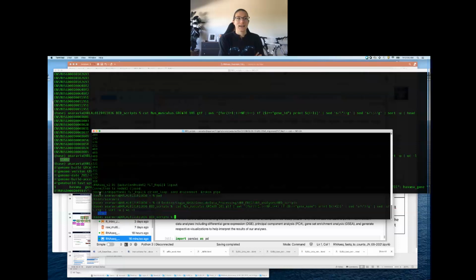Of course, it's less than I had thought, so it's only a little over 100 Ensembl gene IDs that have this issue. When I was thinking of it, I was doing human stuff, and it's actually roughly 1,000 for the human in the same Ensembl release. 1,000 genes with Ensembl IDs that are mapping to multiple or the same gene name. So it's not as dramatic here, but we still have over 100 Ensembl gene IDs that are going to give us the same gene names.